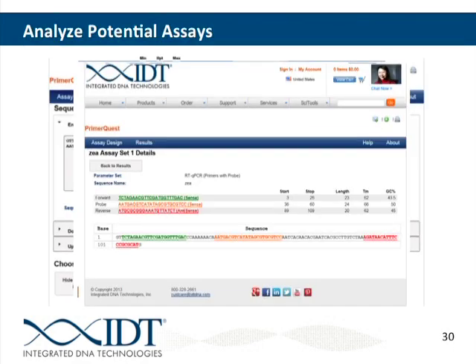Again, try to... Can we go back to the previous slide? Previous one. How do you choose how big the region needs to be? You are now choosing like 4 lines. Could you do just 2 lines? Yeah, absolutely. There's a limit of 120 base pairs that you have to put in. So at least 120. Yeah.